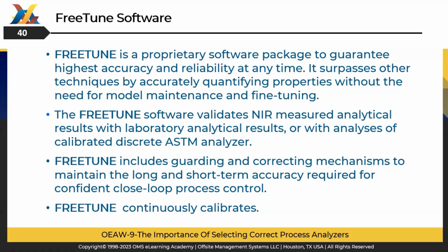Another software used in the industry in order to keep the process simple and models continuously updated is software for automatic model update. The principle of operation of the software is very simple. The analyzer is linked to the internal plant or refinery database, which contains data from the laboratory, for example, a LIMS system.